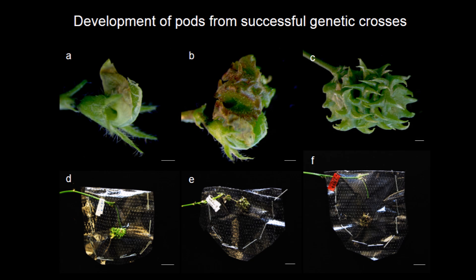Approximately three days after genetic crossing, flowers from successful crosses start curling upwards as shown in panel A. In contrast, flowers from unsuccessful crosses fall off from the pedicel approximately two days after artificial cross-pollination. Flowers from successful crosses continue to develop. When pods develop into medium size, wrap the pods using micro-perforated polythene sheets to prevent falling of pods once they reach maturity. Upon maturity, pods turn yellow and finally become brown in color. Collect the brown-colored pods after they fall off from the plant naturally, then air-dry the pods at room temperature for one week and store the pods for further use.